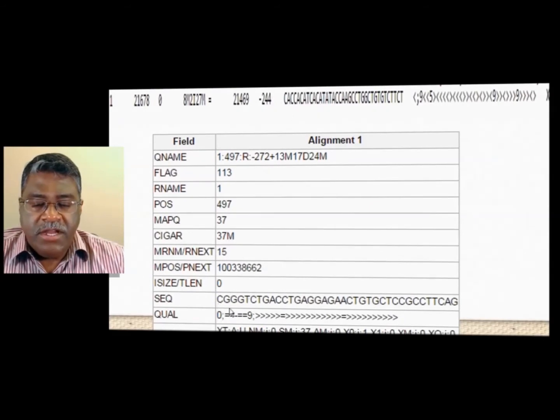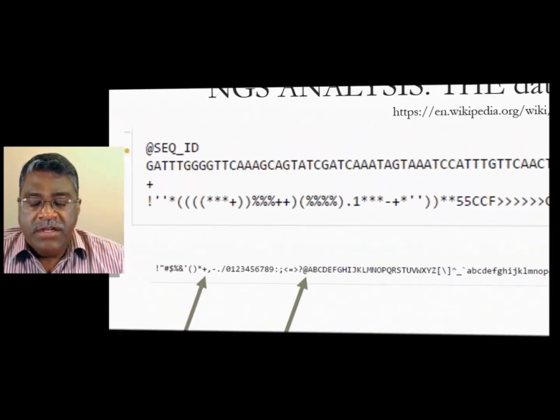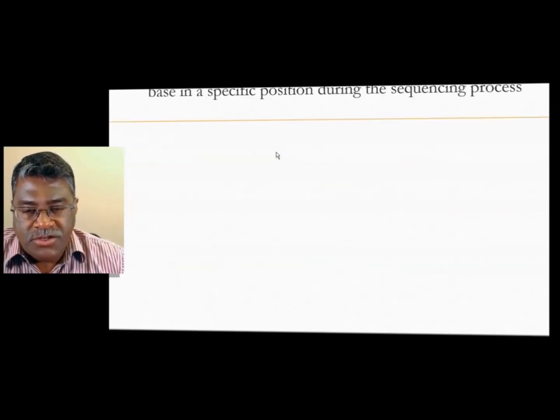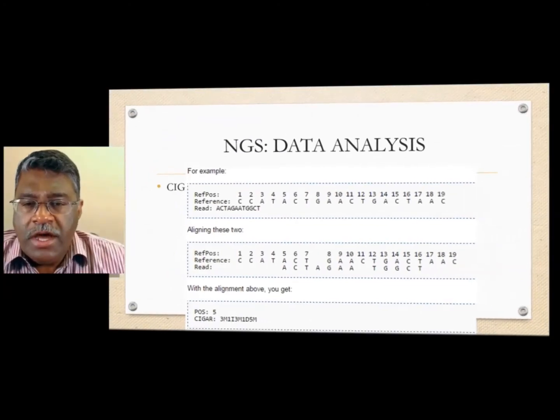For example, you can see the sequence here, that's the read. And we look at the quality scores. And remember, the quality scores are the ones we looked at here, right? So for example, it tells you a qualitative notion of exactly what that score is, what the confidence is in that particular nucleotide being correctly assigned to that particular position. And that's all we look at.